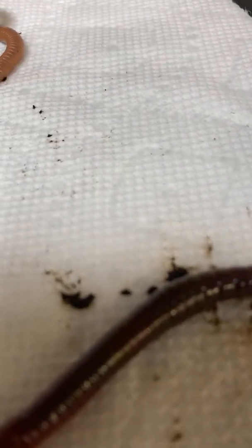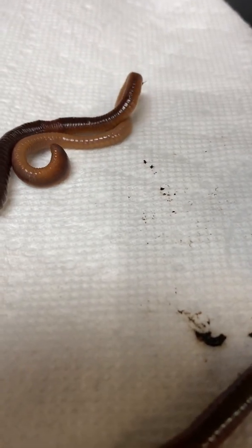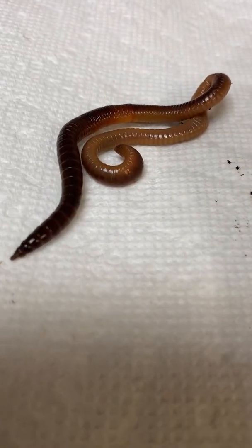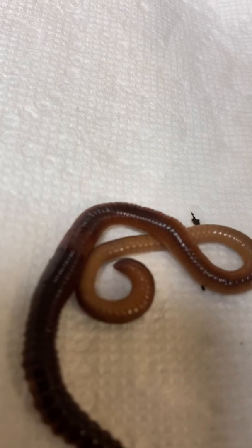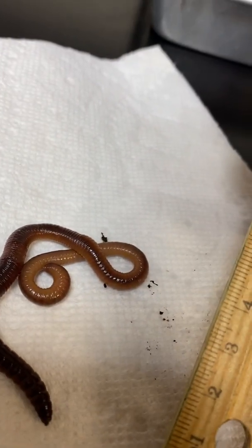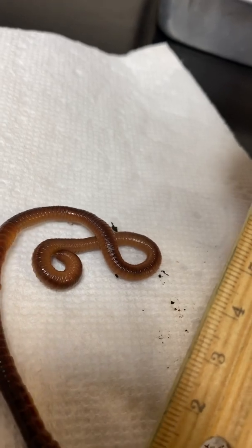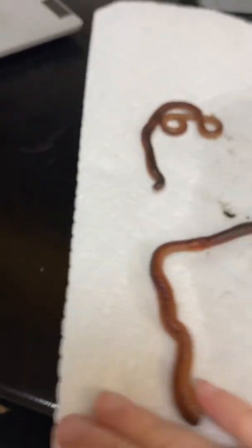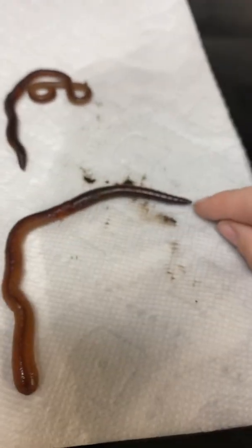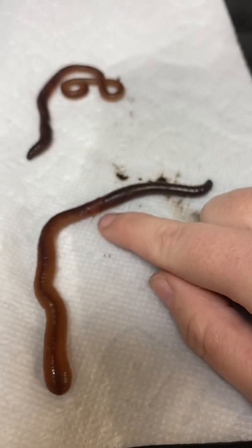That's number 1, 2, 3, 4, 5, 6, 7, 9, 10, 12, 13, 14, 15, 16, 17, 18, 19, 20, 21, 22, 23, 24, 27, 28, 29. So there's 32 metameres, segments, from the prostomium, the mouth, the anterior end, up until the clitellum.